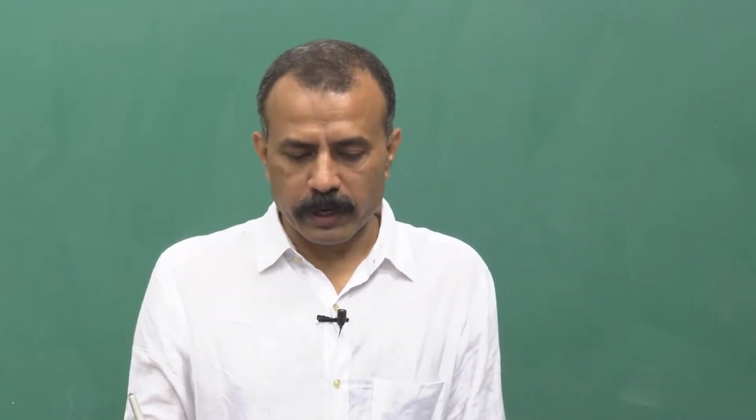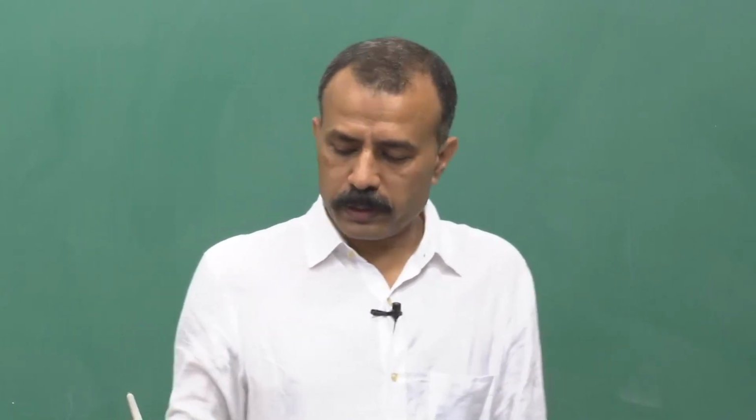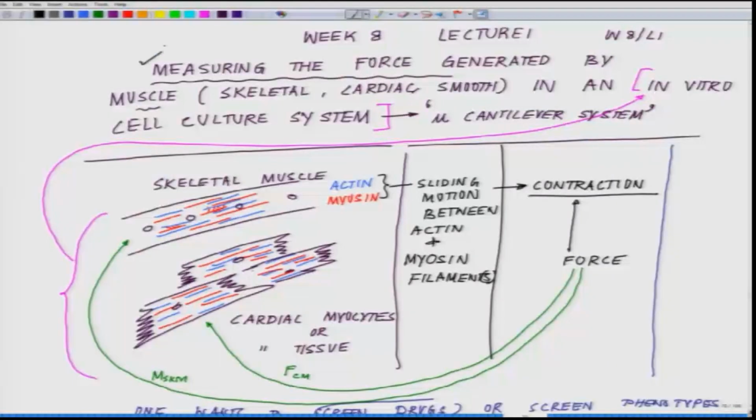So, now let us go back. What is our problem statement? Our problem statement was, and is, measuring the force generated by muscle, whether it is skeletal, cardiac or smooth, in an in vitro cell culture system, which is a micro cantilever system.